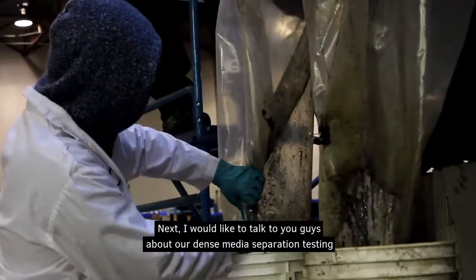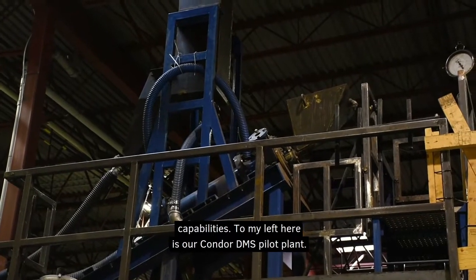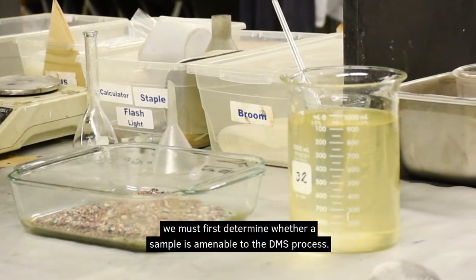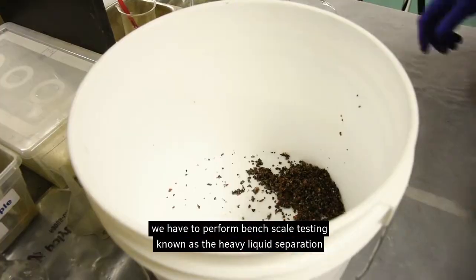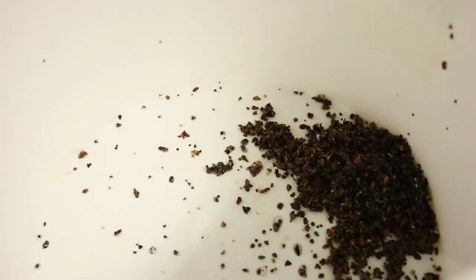I would like to talk to you about our dense media separation testing capabilities. To my left here is our Condor DMS pilot plant. But before any piloting work actually takes place, we must first determine whether a sample is amenable to the DMS process. To achieve this, we have to perform a bench-scale test known as the Heavy Liquid Separation test, or HLS test.